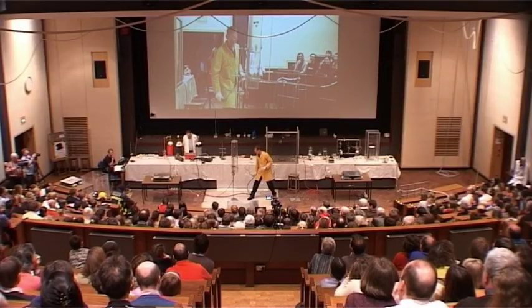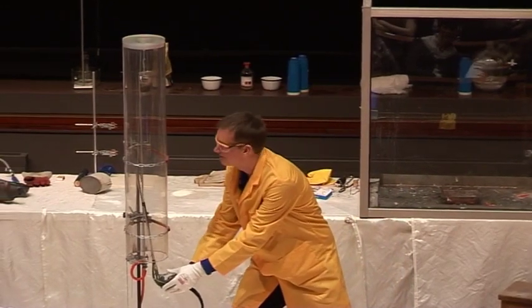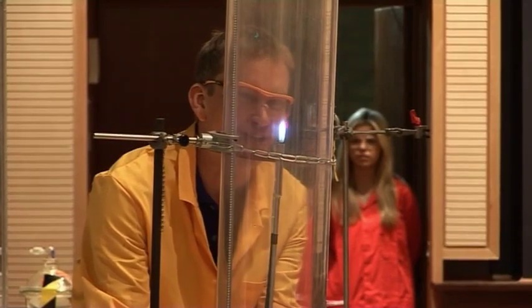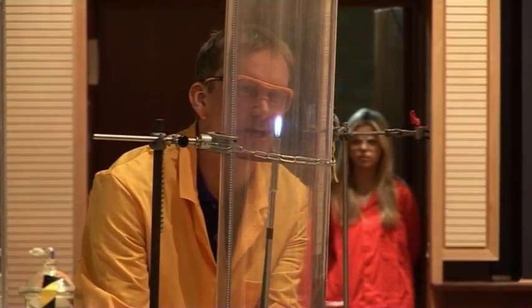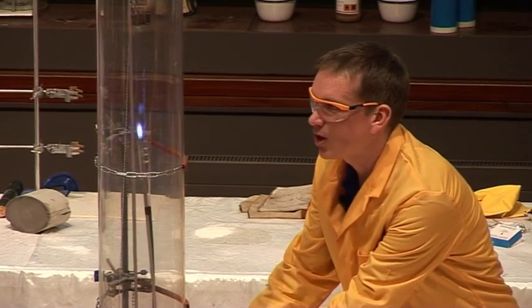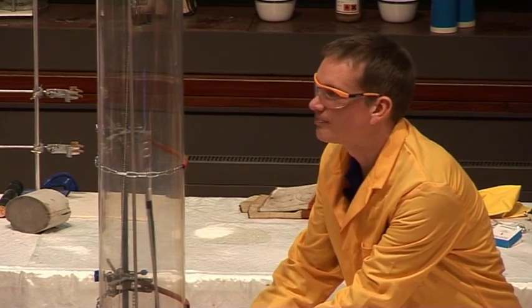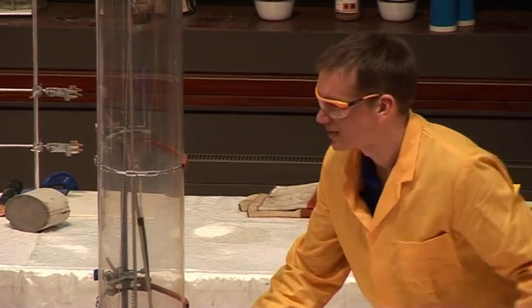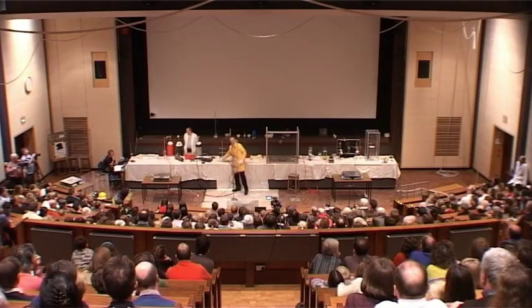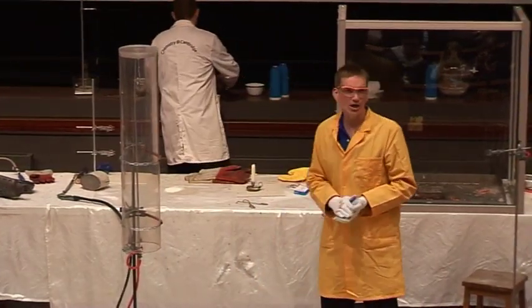Okay, sparks are on and oxygen — there we are. So this is oxygen gas burning in hydrogen, which is actually pretty good. Oxygen itself doesn't burn in air, but it does burn in hydrogen. Phew, so far so good. We can light oxygen inside hydrogen.